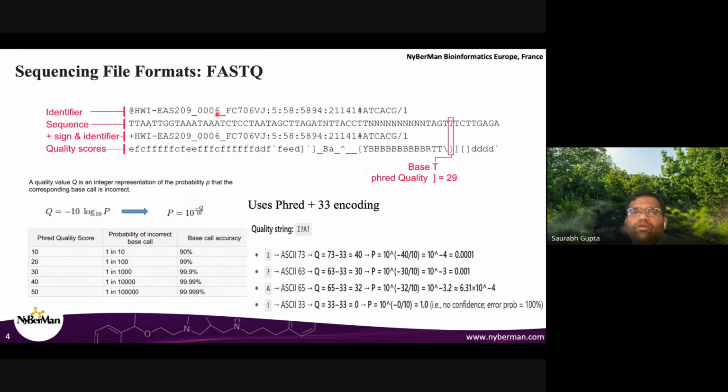If you have to break down this ID, the way you would try to interpret it, again, nobody reads it. It's just for your understanding of what a read identifier represents for Illumina. Nobody has to remember this, because all the tools take care of it automatically. The first bit after the @ sign, HWI etc., till the first colon, is the ID of the sequencer. This particular data is coming out from a certain sequencer, one physical machine provided by Illumina.